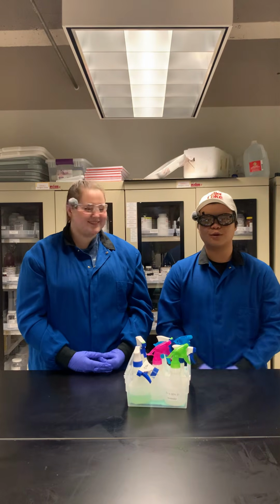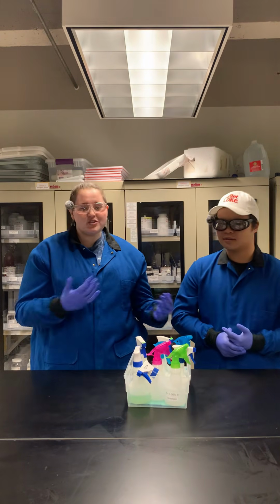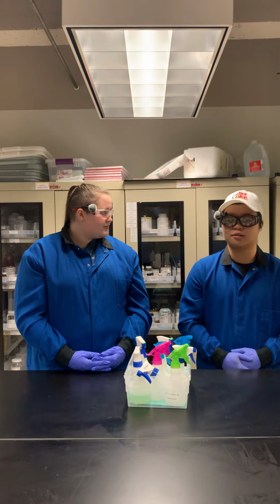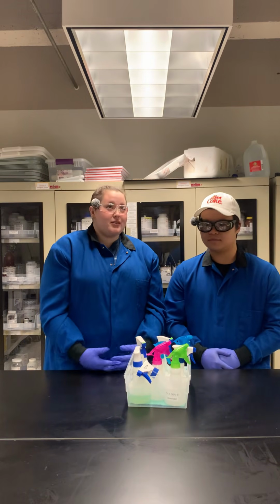Whoa, that was cool. Why were the metals so many different colors? Well, each metal is different, so the energy gap between orbitals is different as well. That is really cool. I know, right? I can't wait to try this with every metal I can find.